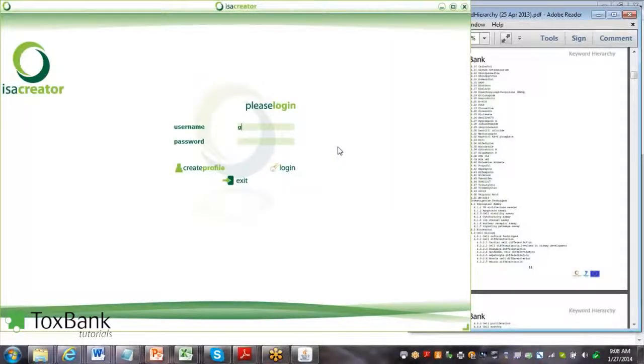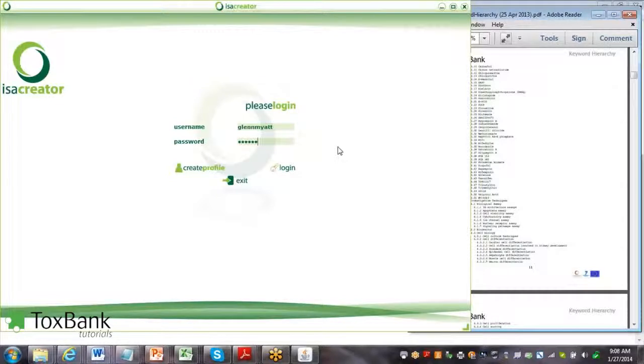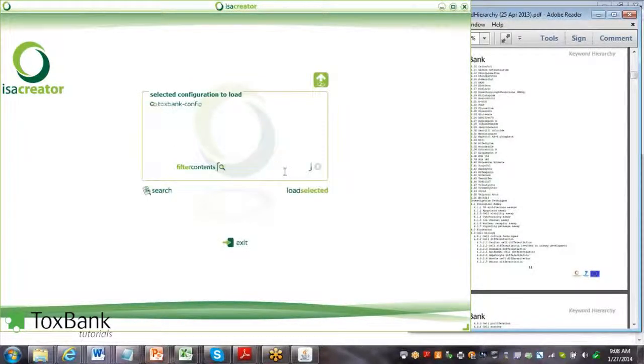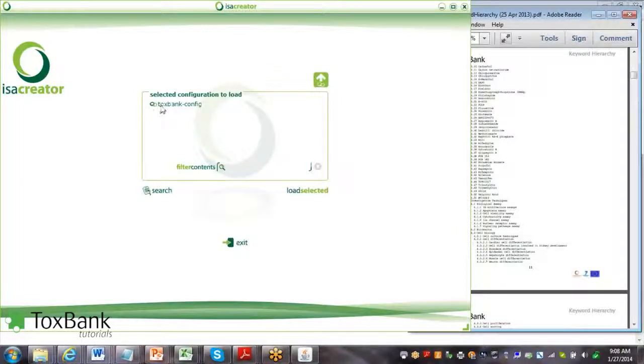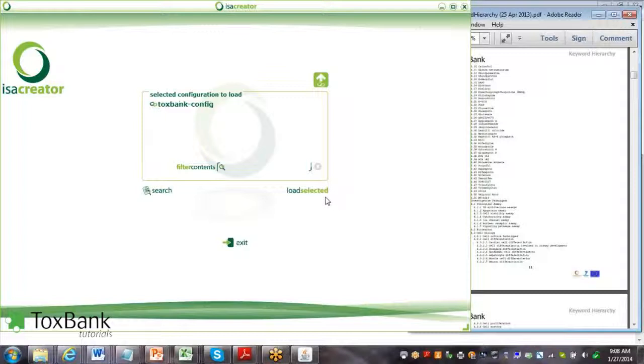Once I've logged in, we want to select the Toxbank configuration because that will link the ISA Creator to the Toxbank data warehouse.